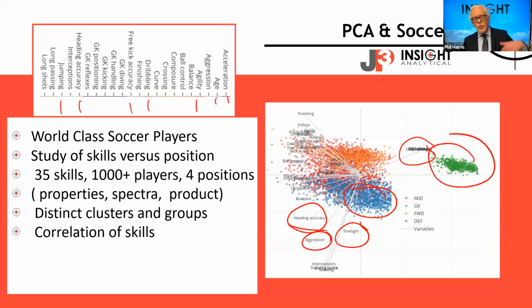So we start to do a bunch of things when we talk about chemometrics. You'll often hear people start talking about a word, pre-processing. Before we get to this whole analysis of stuff, we want to make the data cleaner and pull out more information or make information appear more obvious to us.